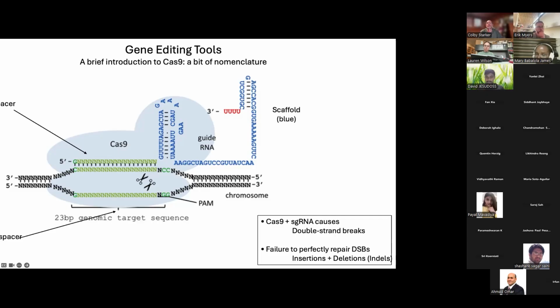Sometimes the G doesn't work so well, but in the majority they work. So now I'm designing some others, and I'm getting a little confused. When you read about CRISPR-Cas9, some programs give you the strand of the gRNA that it reads and the PAM region, but it's the opposite strand, right? How can I explain?